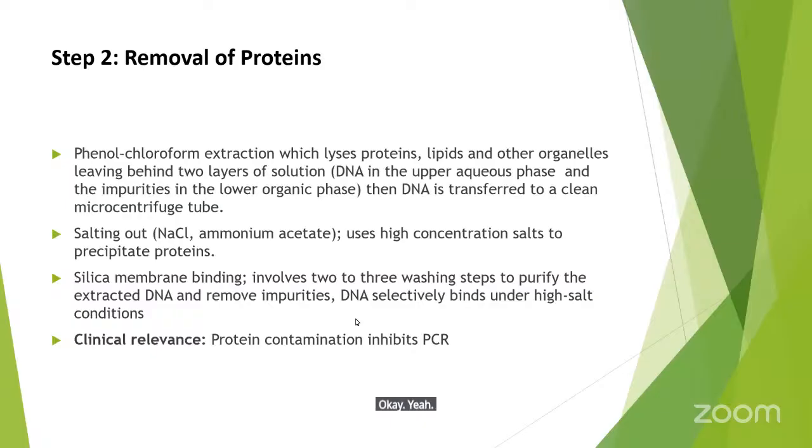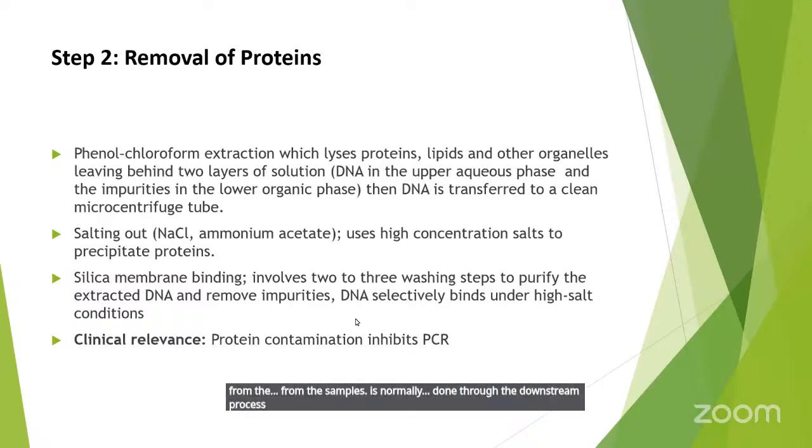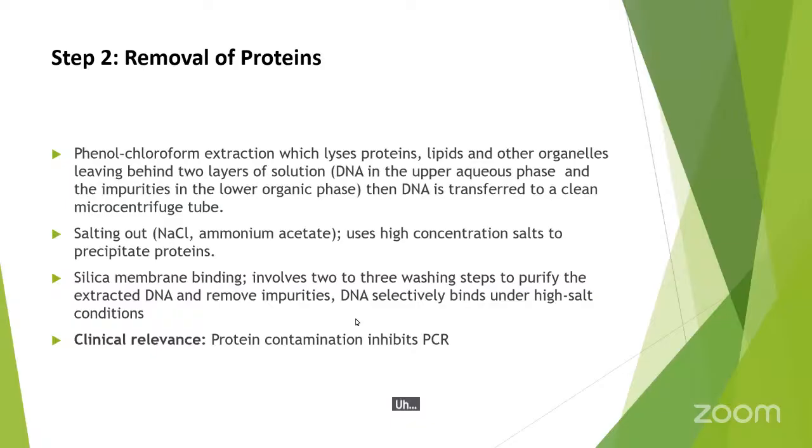Yeah, thank you very much, Opio. As we had discussed earlier, the removal of proteins from the samples is normally done through the downstream process of extraction. The process of lysis, as I told you, cell lysis involves the removal of cells.